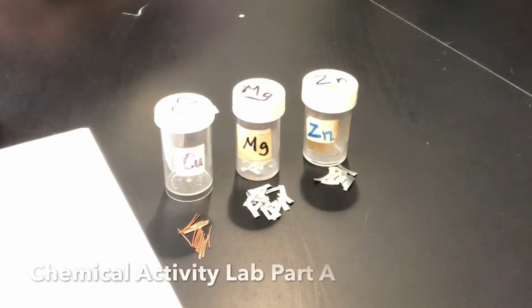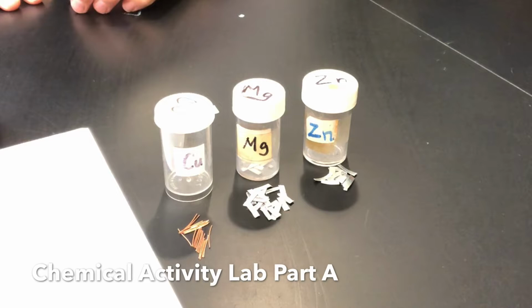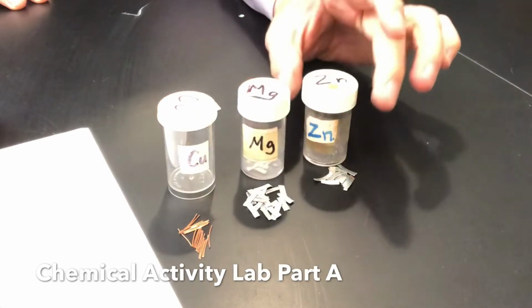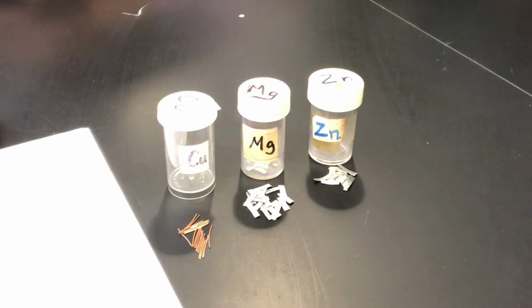We are back and we are looking into the chemical activity of metals. Today we're going to be looking at 4 different types of metal. We're going to be looking at copper, magnesium, zinc, and also silver. You'll notice that silver is missing.